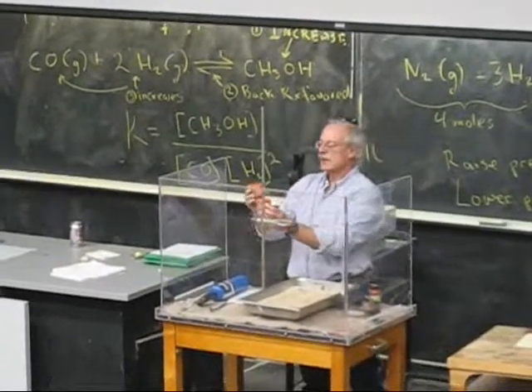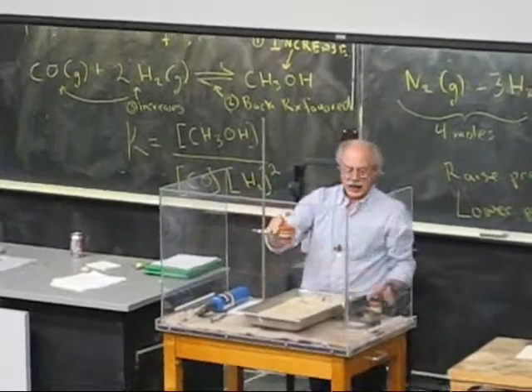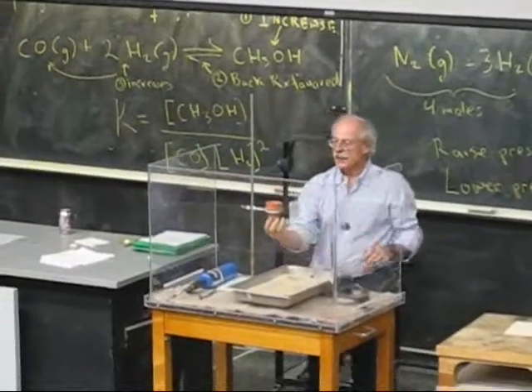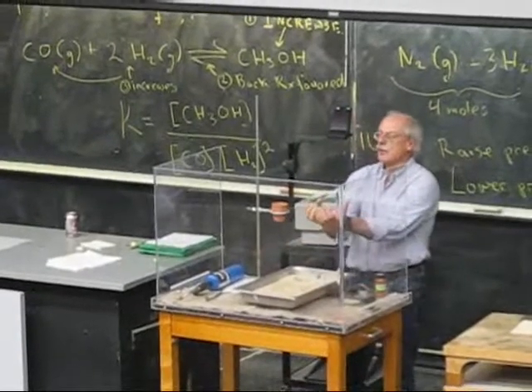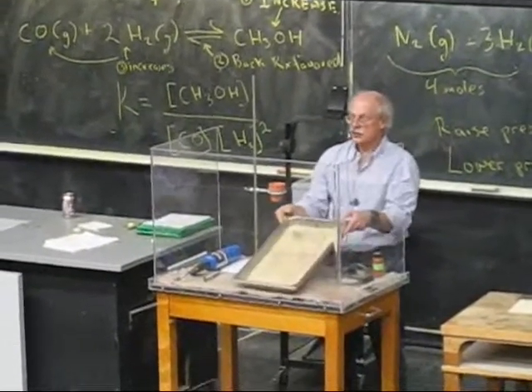And they've got two of them because these are going to explode during the reaction. And as the reaction proceeds, this is going to crack, and you're going to see this blob of molten iron dropping down into this sand tray here.